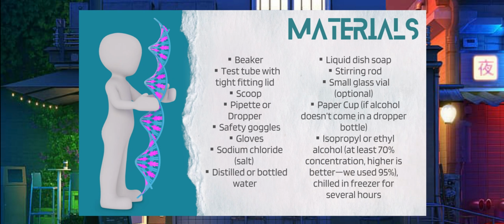So, these are the materials that we will use in the experiment. Beaker, scoop, safety goggles, salt, hand soap or liquid dish soap, small glass vial, paper cup, alcohol, test tube with tight fitting lid, pipette or dropper, gloves, distilled or bottled water, stirring rod or wooden skewer.